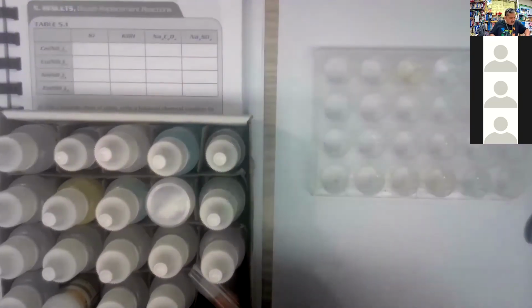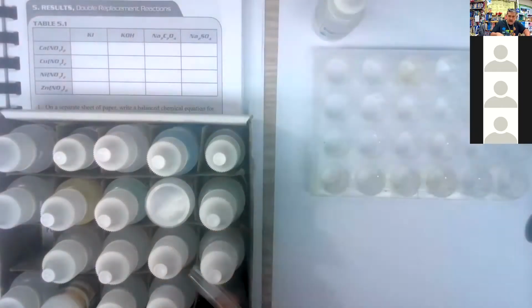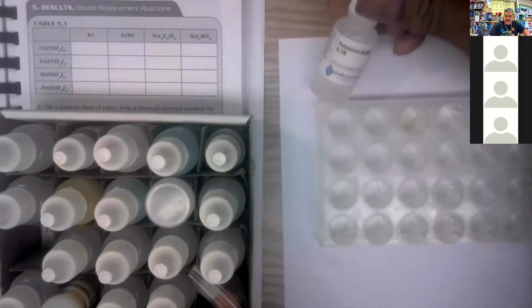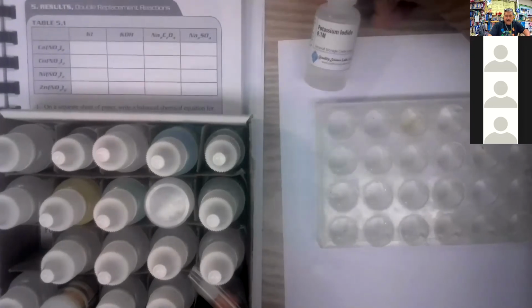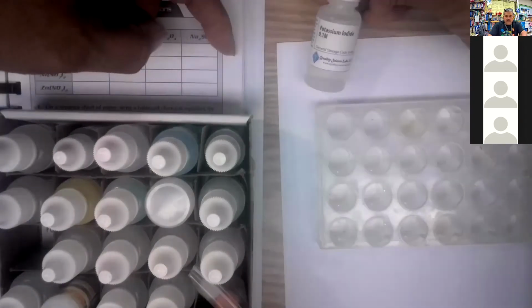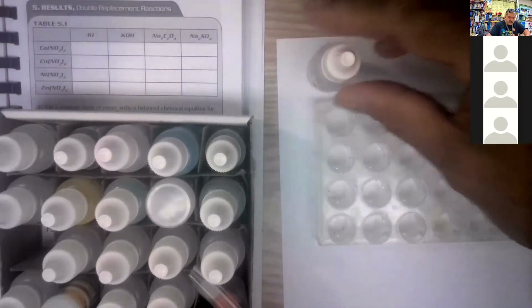All right, so the first one is KI, potassium iodide, and your potassium iodide is right here. Okay, so I'm going to put that right there, potassium iodide. You see that? There's your potassium iodide. That's this one right here. So I'm going to put these 4 bottles across the top, and then these 4 bottles on the side, and then we'll add 3 drops of each.